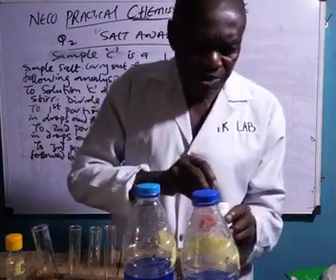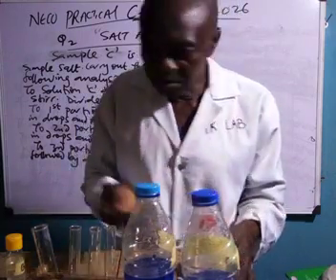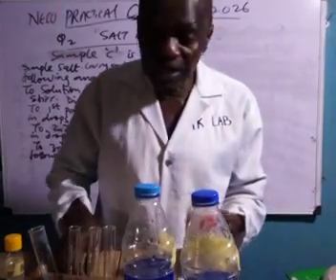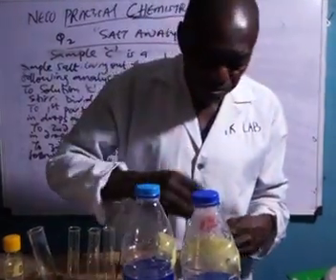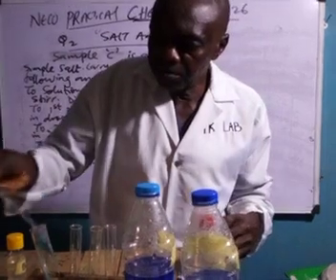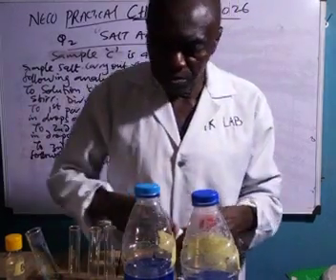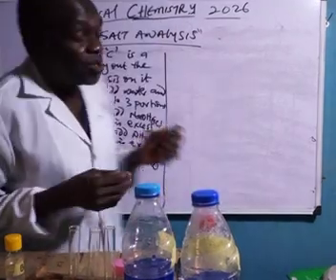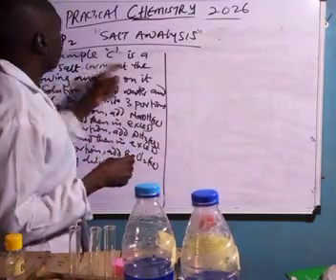So this is the salt I have here with me. Only a little, okay, let me add a little more. So this is what I have here. They say follow the instruction to sample C: add water and stir.